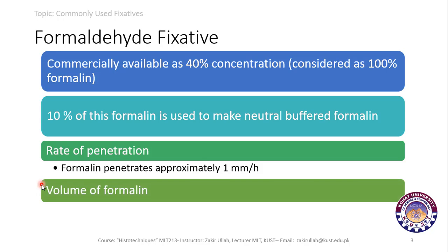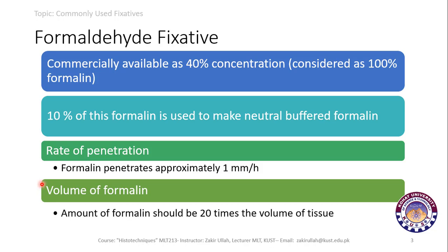The volume of formalin required for the tissues, the amount of formalin, should be 20 times the volume of the tissue, or in other words, the tissue should be fully immersed within the formalin for proper fixation.